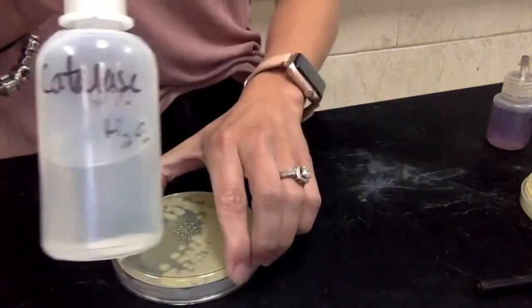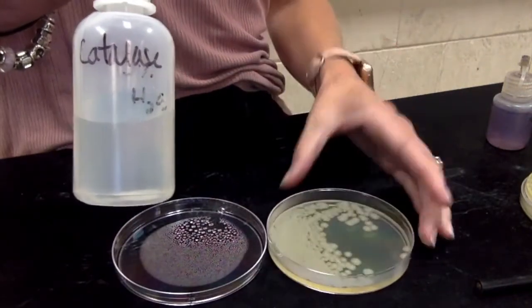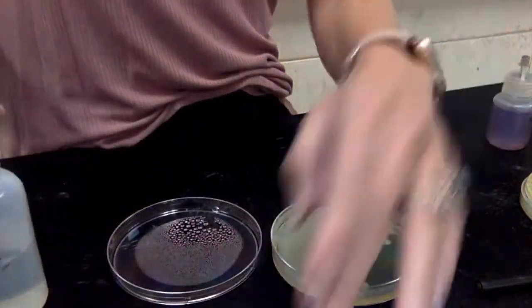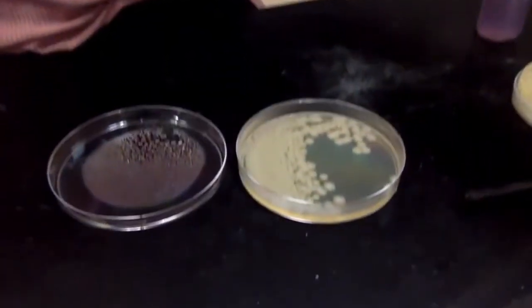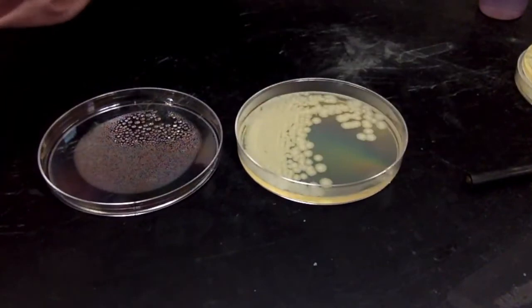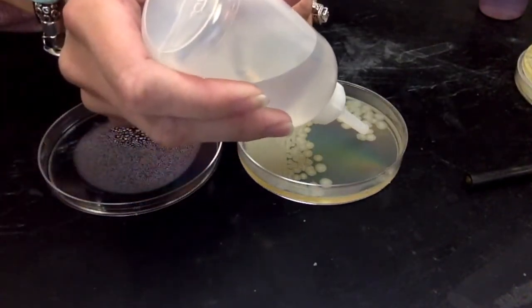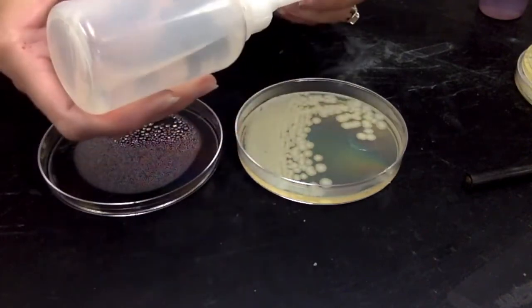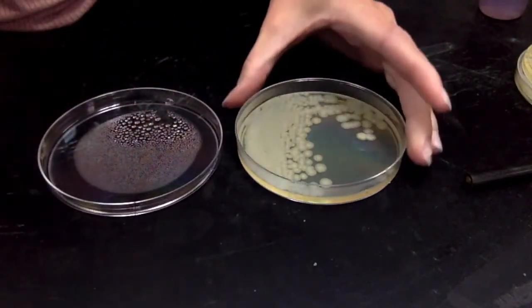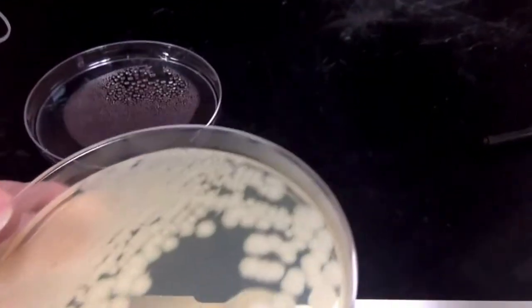So I'm going to add my hydrogen peroxide to my Bacillus. You actually have to open the plate up and then put it directly on the plate. So hopefully you can see this easily. So you see those bubbles?